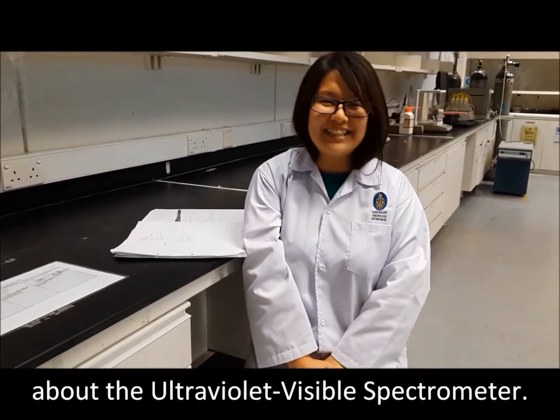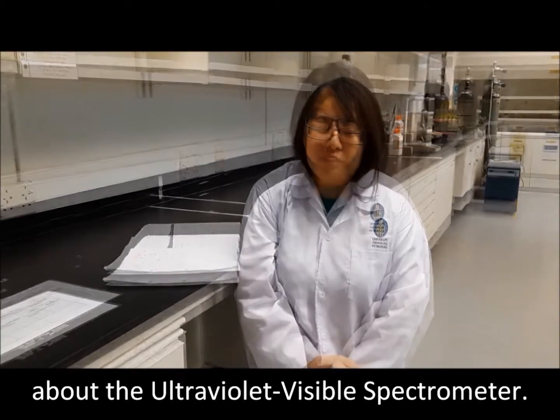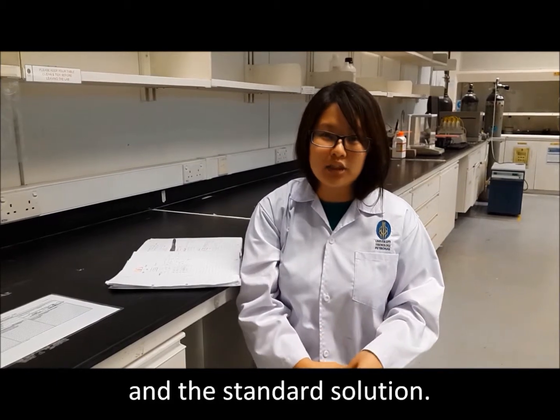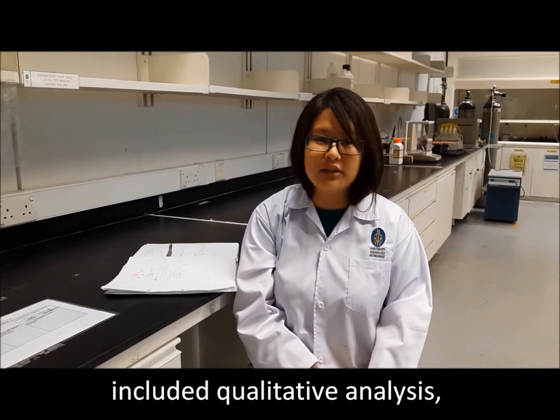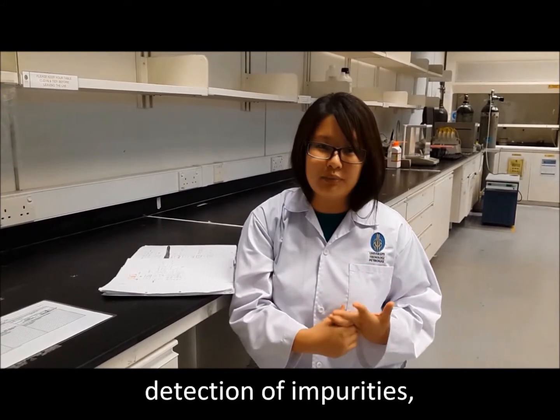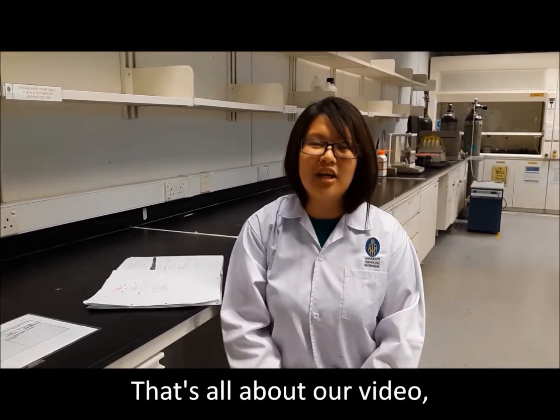I'll try to summarize about the ultraviolet visible spectrometer. Spectrometer is useful for both qualitative and quantitative measurement, where a beam of light passes through both sample and the standard solution, where it can be analyzed through the spectrometer. The applications of the spectrometer include qualitative analysis, quantitative analysis, detection of functional group, detection of impurity, HPLC detector, and reaction kinetics. That's all about our video.